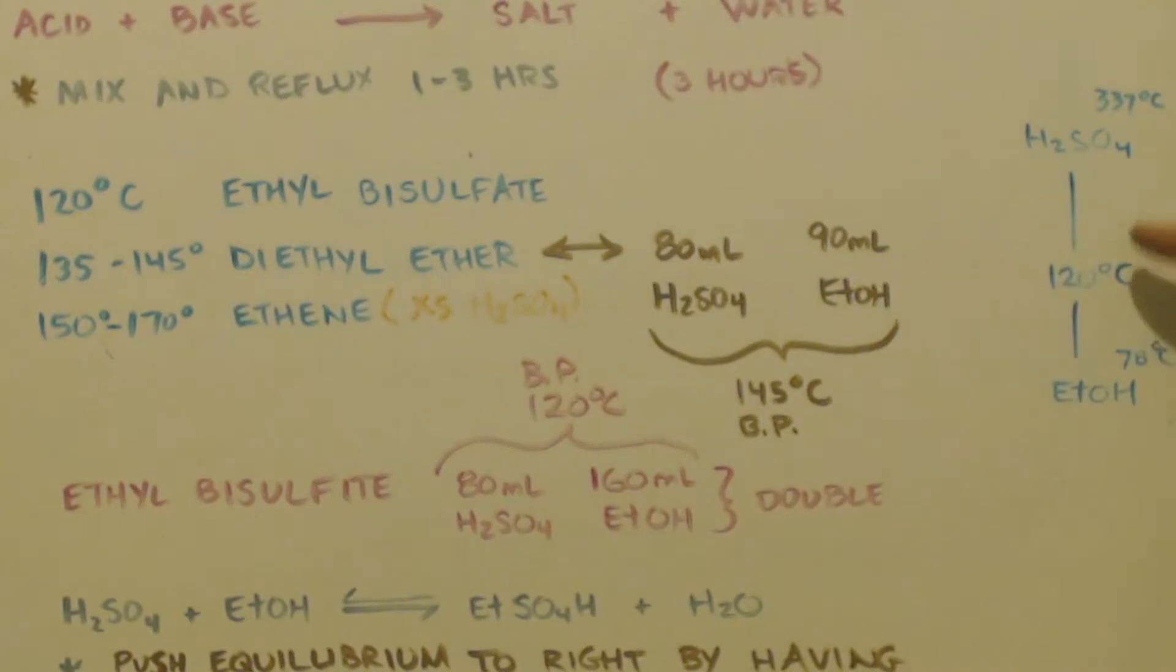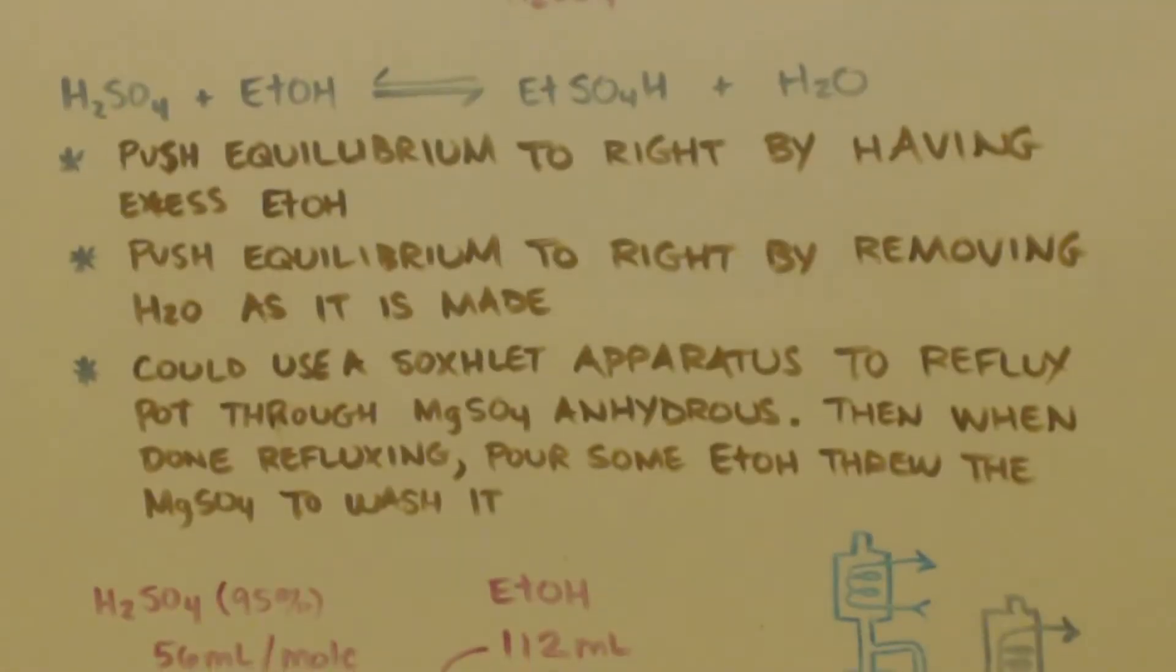If I get it up to 125 Celsius and it's not boiling, that means I need to add some ethanol in so I can lower the boiling point. If it's boiling and it's not 120°C yet, that means I need to add just a little bit more sulfuric acid to get the boiling temperature up to 120, 125.